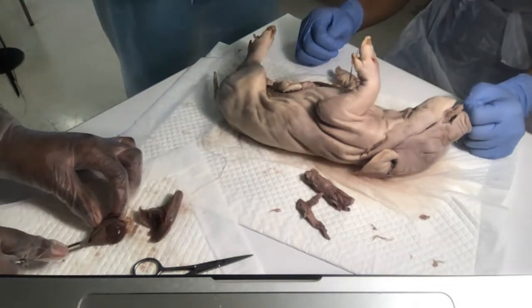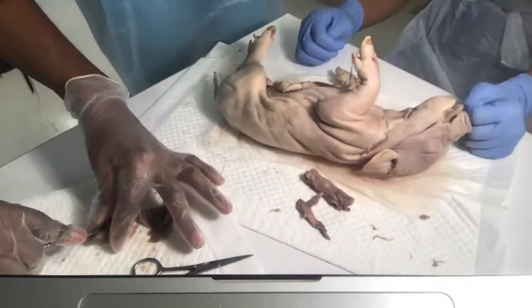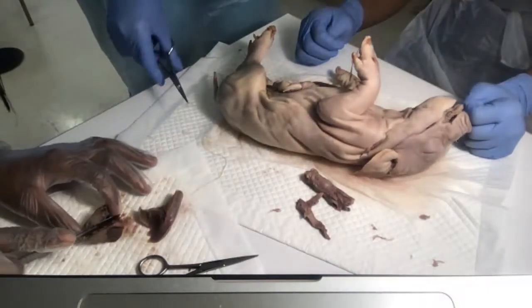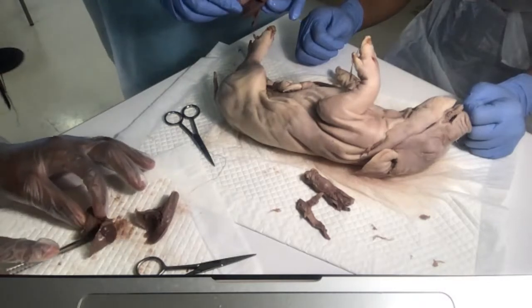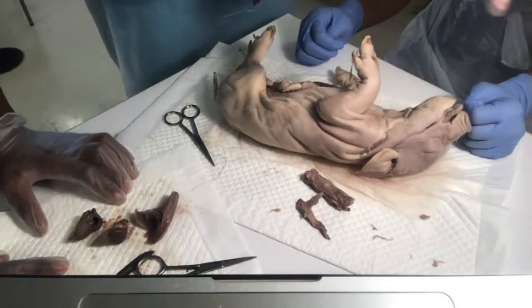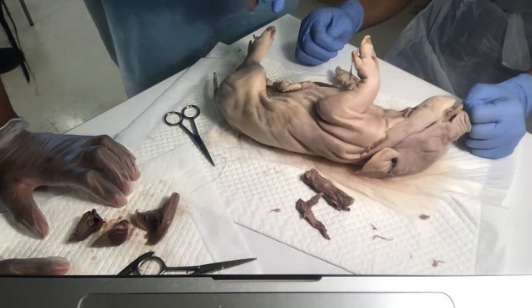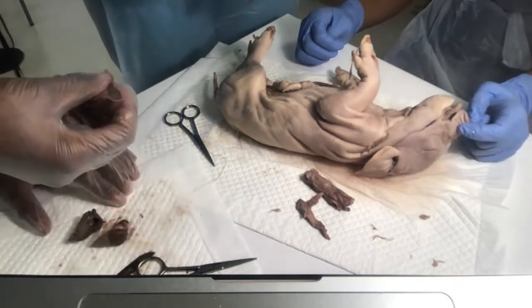What do you see when you open that up? I mean, you cut it all the way. Yes, all the way. So when we look at it, it looks spongy, because it makes sense, there are holes and there's tubing in it. Now, when you look at the end of the lung, do you feel anything hard? No. You don't feel anything because remember, it's only at the beginning part of the lung that there's some cartilage. But near the ends, it's more smooth muscle. Hint, hint, beautiful question.